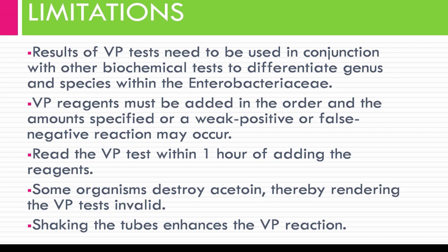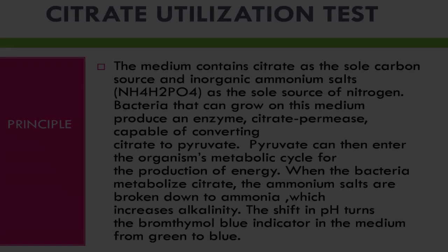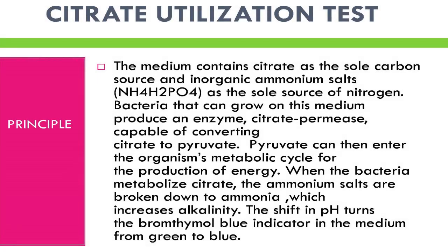VP reagents must be added in the order and amounts specified, or a weak positive or false negative reaction may occur. A weak positive reaction may appear as a copper-like color due to the reaction of potassium hydroxide and alpha-naphthol. Read the VP test within one hour of adding reagents; potassium hydroxide and alpha-naphthol may react to form a copper-like color causing a potential false positive. Some organisms destroy acetoin, rendering the VP test invalid. Shaking the tube enhances the VP reaction.